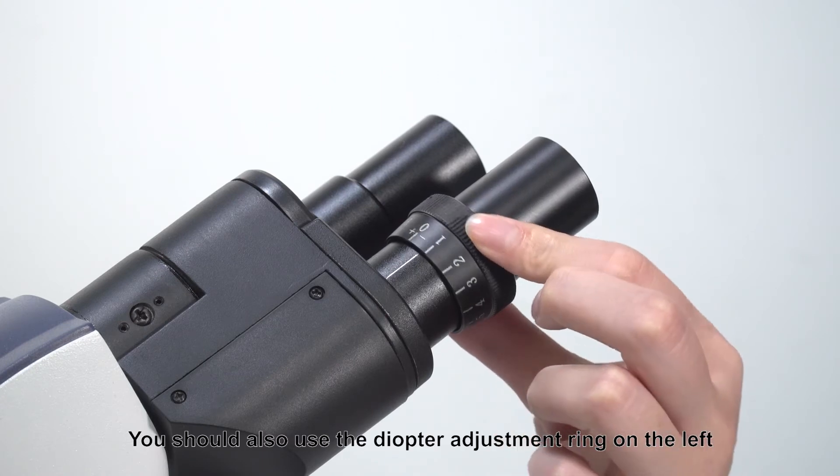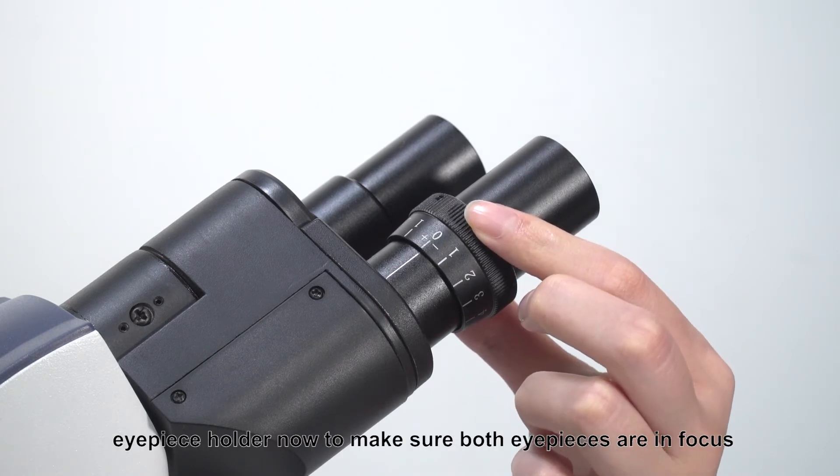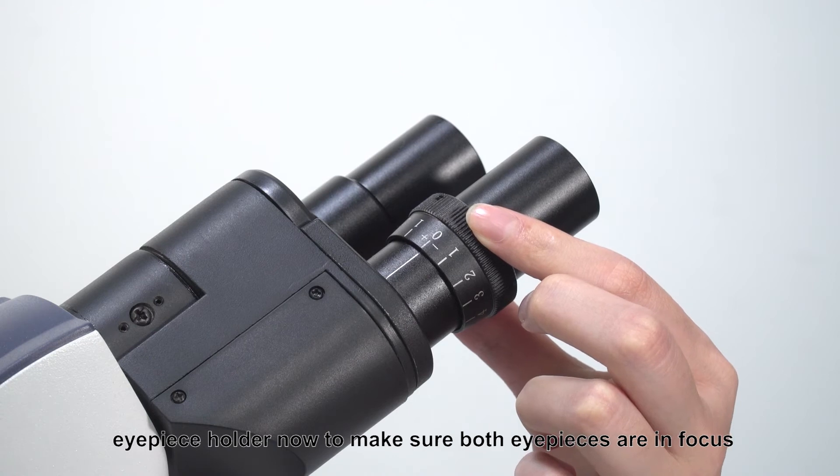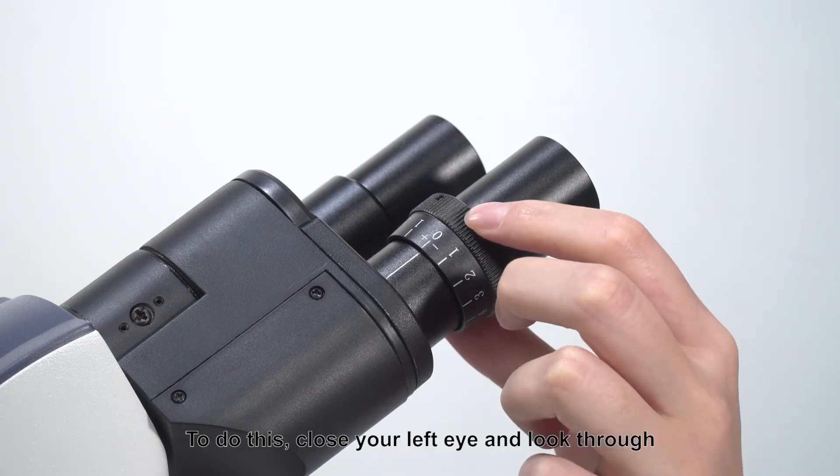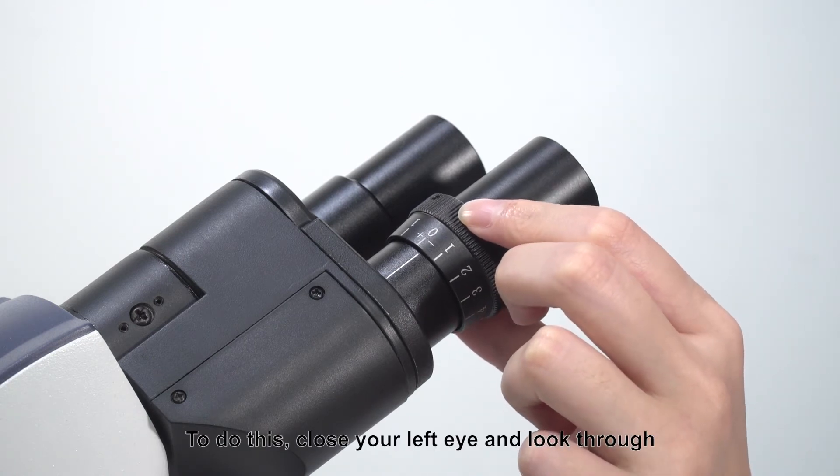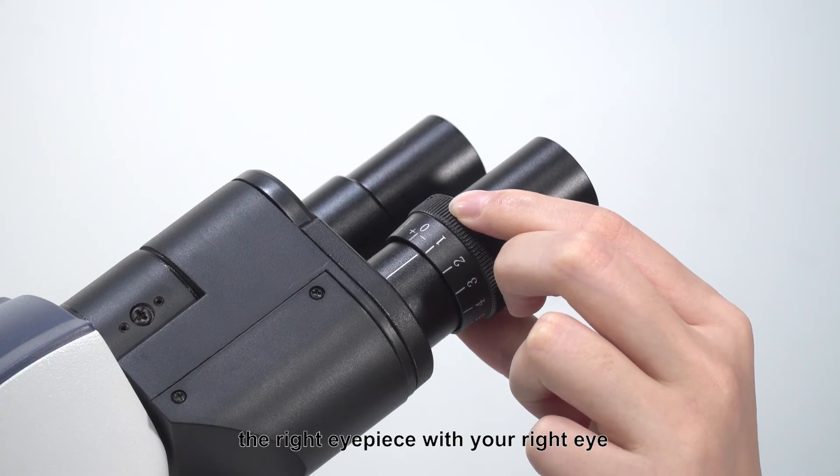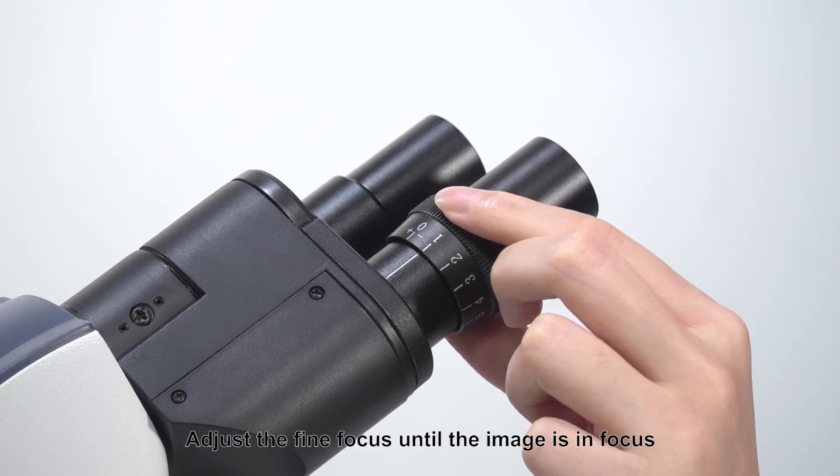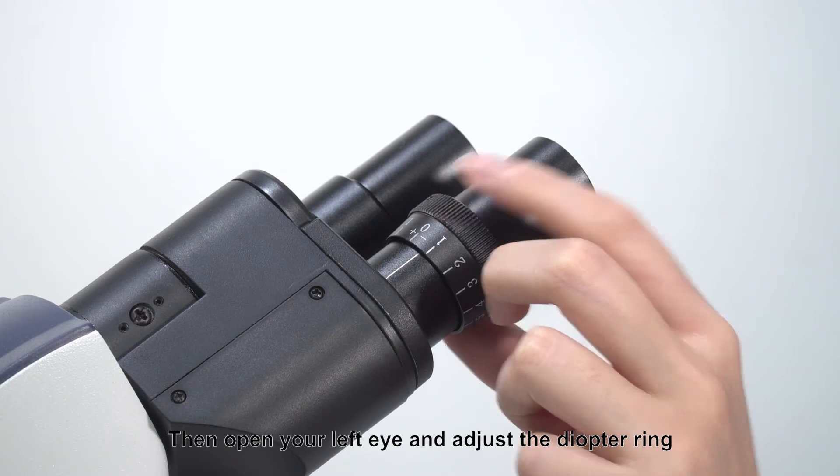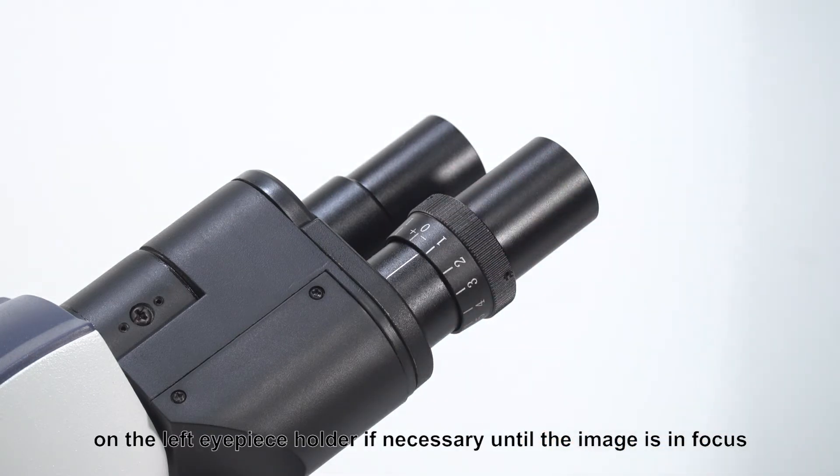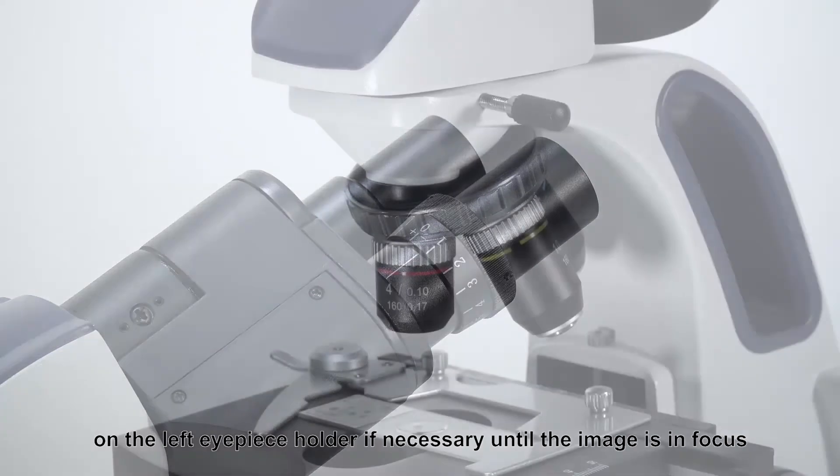You should also use the diopter adjustment ring on the left eyepiece holder now to make sure both eyepieces are in focus. To do this, close your left eye and look through the right eyepiece with your right eye. Adjust the fine focus until the image is in focus. Then open your left eye and adjust the diopter ring on the left eyepiece holder if necessary until the image is in focus.